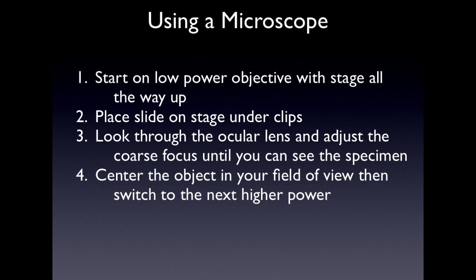Once you've found the object, you may want to make sure that it's centered in your field of view. Remember that when you go to the next higher magnification, you're going to be zooming in, and if it's not centered, when you zoom in to the next higher magnification, it may be outside your field of view.